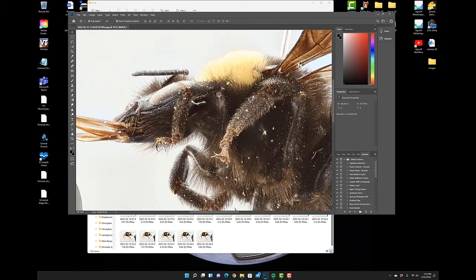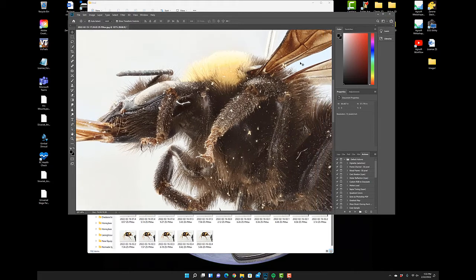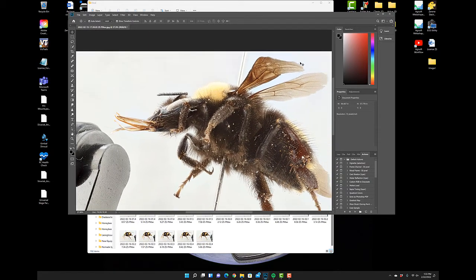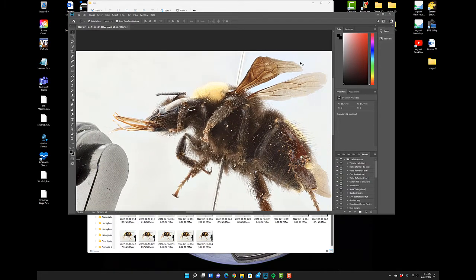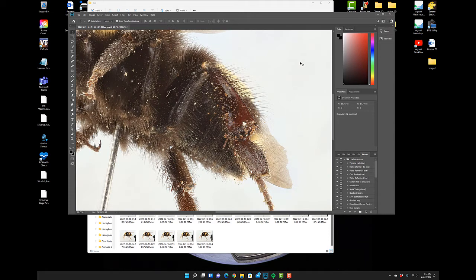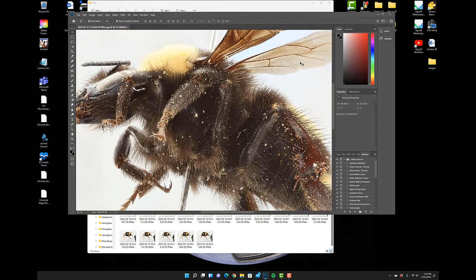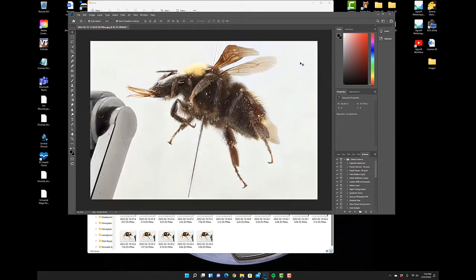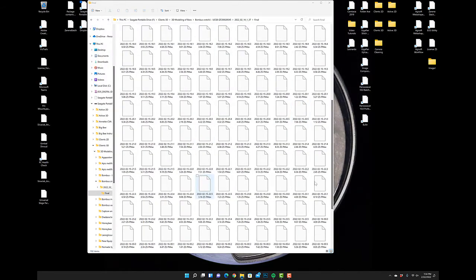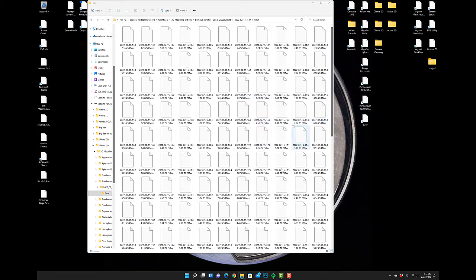And there's no particular section which is just showing up bright white, which is an indication that it's an overexposed area that the 3D modeling software might have trouble recognizing. There's also no areas on here that are too dark. Even though this is a dark colored specimen, we hit it with quite a bit of light so we can make out just about every structure. Nothing is blending into the background. And I would say that's true even when our universal stage is in the way or gets behind the specimen.